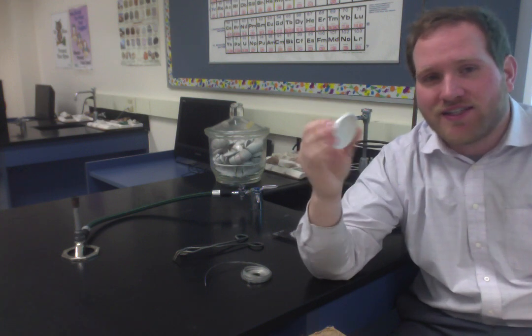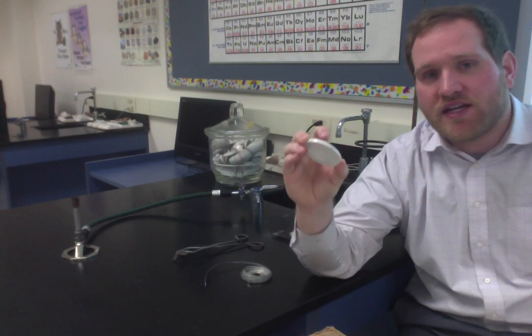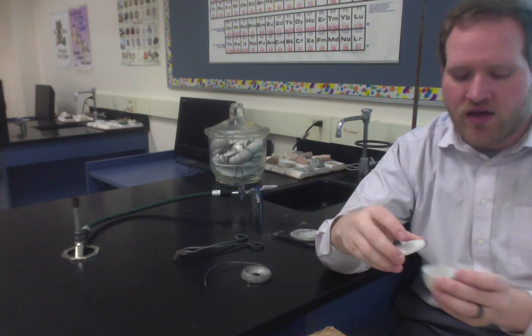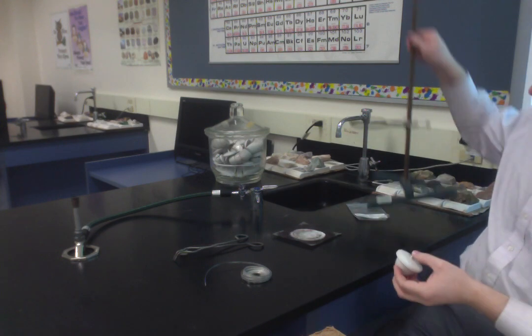That's only because these lids have a tendency to break during labs. I shouldn't say that as if it's expected, but it has happened. And if you find the mass of the lid separately and then the lid ends up breaking on you, you can just grab a new lid, find the new mass of that, and you don't have to restart from scratch. So you're going to find the mass of the crucible, you're going to get the mass of the magnesium, and we're going to burn it.